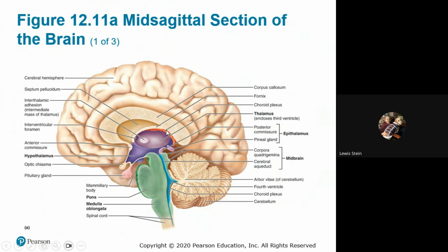Blood vessels, and almost all veins, retain their blood. Arteries typically do not. So when you see little nests of dark looking stuff, it's probably a vein. We find these choroid plexuses, that's the plural, in the ventricles. You should see this one. You can almost run the back of your blade or a probe around it to feel the third ventricle. There's an opening that's hard to find, but when you get below it, you'll easily be able to see it.